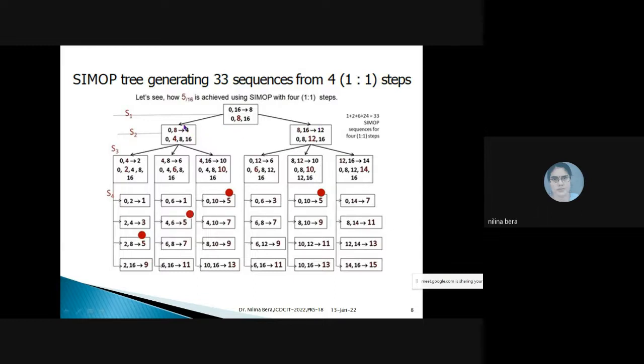Now for the third step I am getting 3 branches. Whatever the new C intermediate I am creating, I am carrying forward all the initial buffer, sample, and also the existing C intermediates. That means in my third step I am getting a lot.